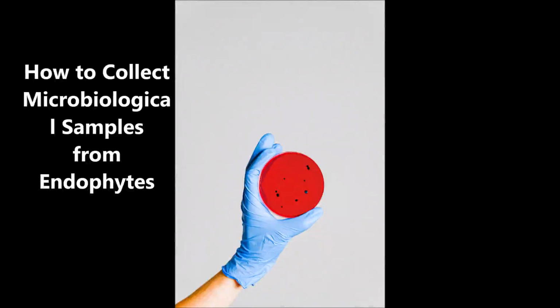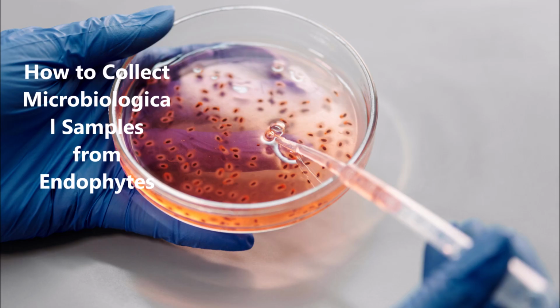How to collect microbiological samples from endophytes. That is the topic of this webinar today.